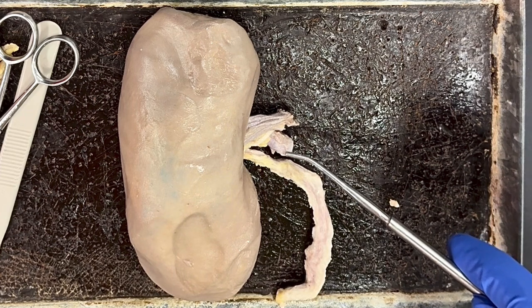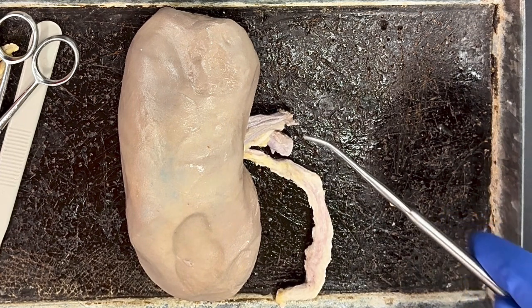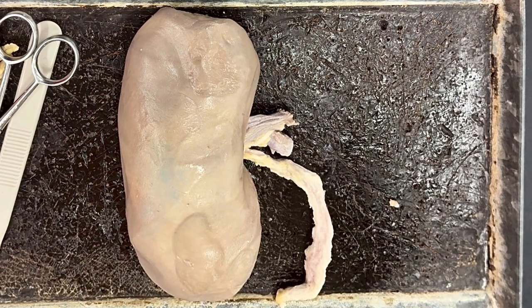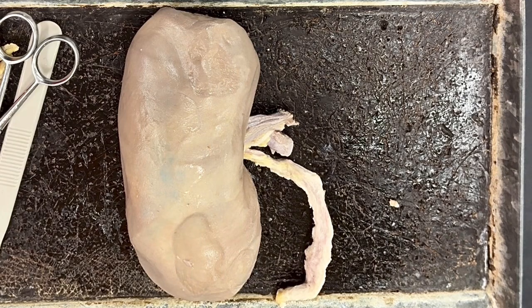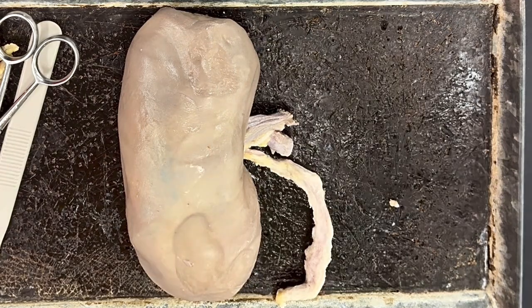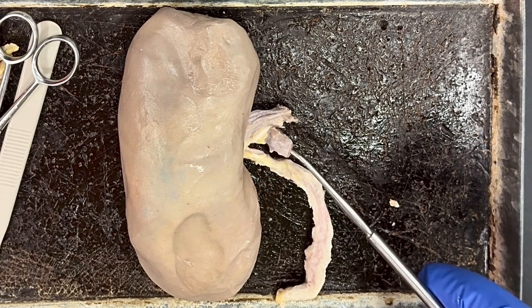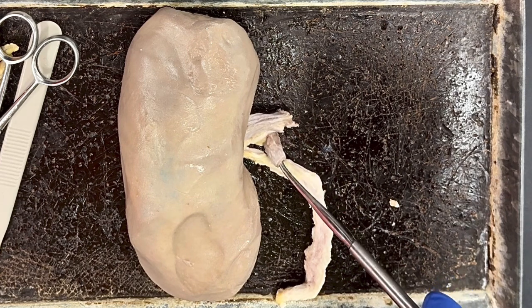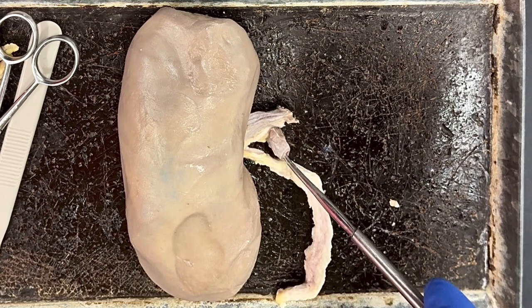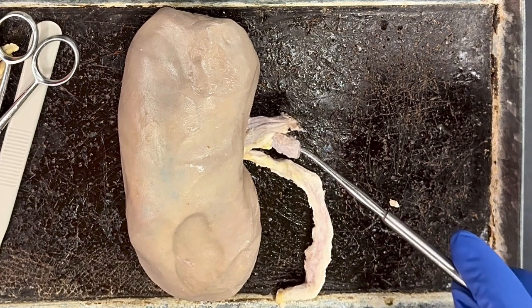Now, the reason I can tell the difference between the renal artery and renal vein has to do with the differences that we've discussed prior in this class about arteries versus veins. Remember, arteries carry blood at a much higher pressure. Therefore, they are going to have thicker walls. Oftentimes, they're also more rounded when we look at the shape of that vessel, especially if we look at it underneath the microscope.